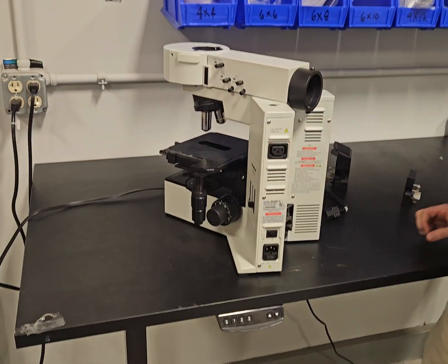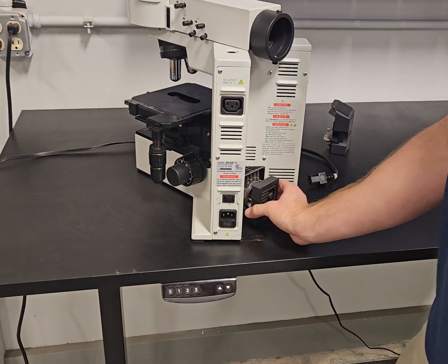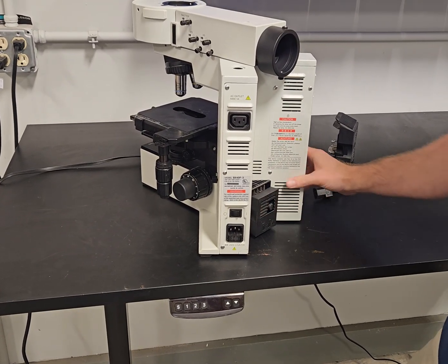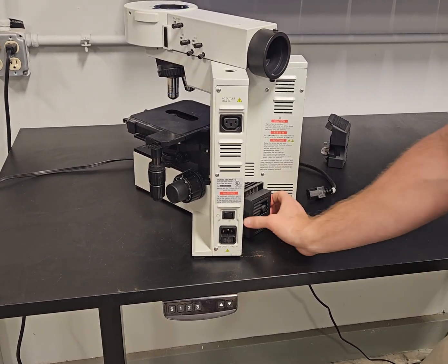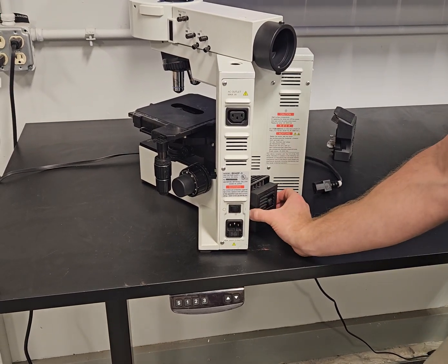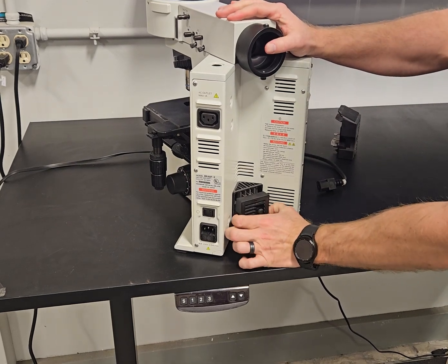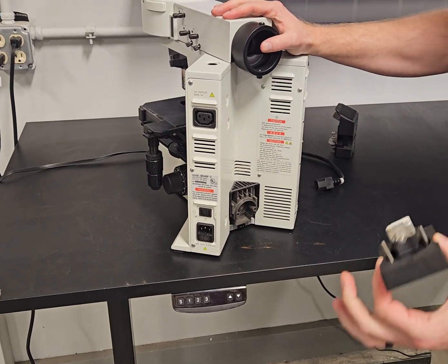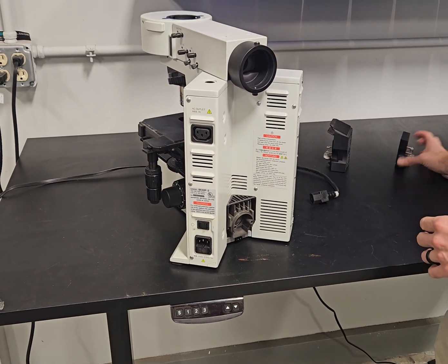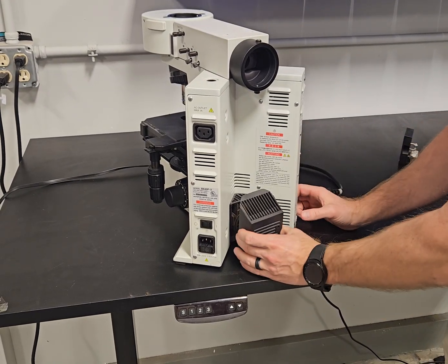To show you how to remove your old socket, we're gonna unplug it. Pretend this is your old broken socket — it's busted, not working. You're gonna take this, make sure the scope's off and unplugged, put your fingers right here on the sides, press, and wiggle it out. When that comes off, you can take your new socket that you just ordered from us and replace it.